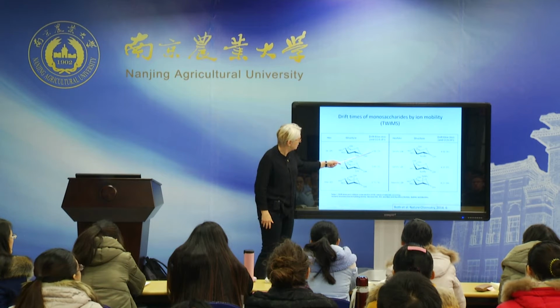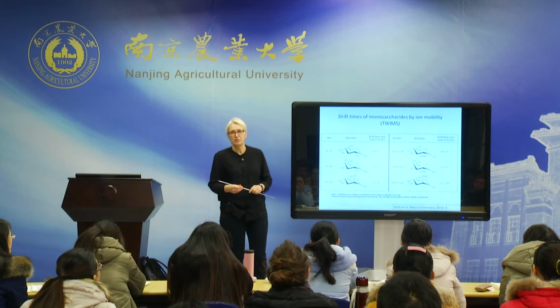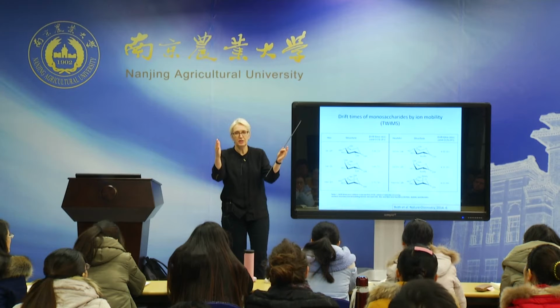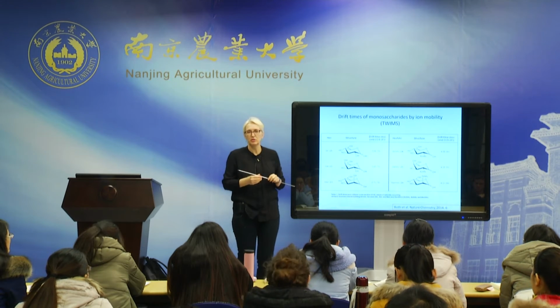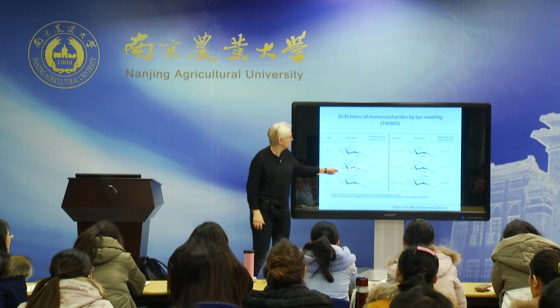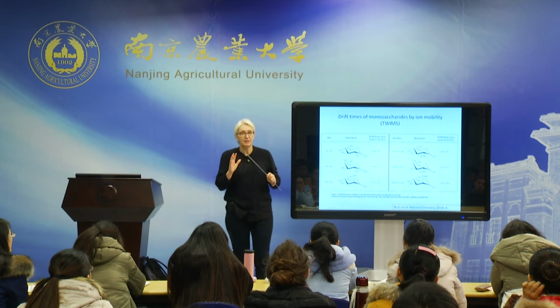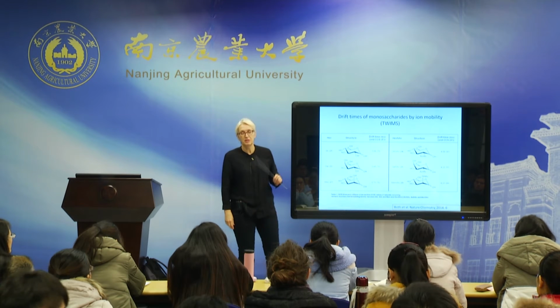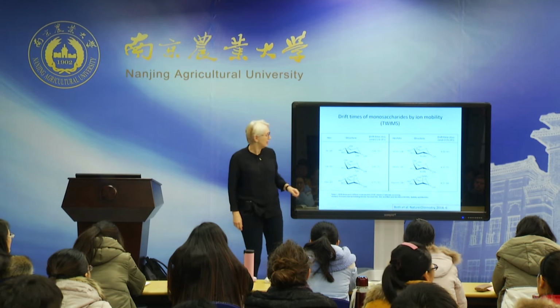And you can see actually 3.84 and 3.68 is different, and it's significantly different because you're actually dealing with a very defined technique, very defined tube, very defined gas phase. You can actually control the pressure of your drift gas and the flow and everything, temperature and everything. These are very, very precise, and they're very reproducible. Yeah, so we can rerun the experiments and get exactly the same number. The error bars, I haven't put them in here, but they're really much smaller than the difference.